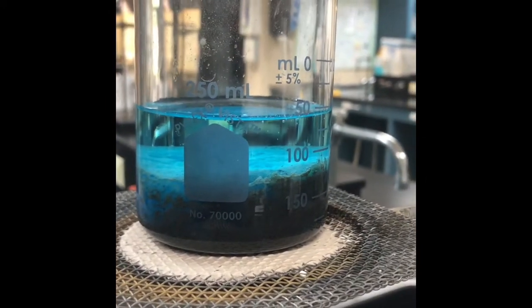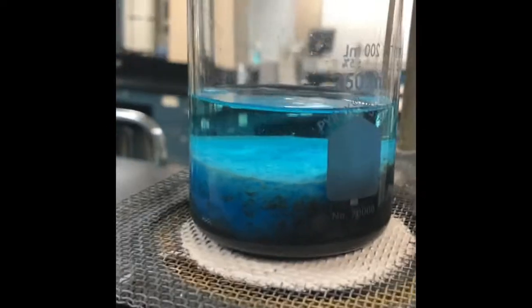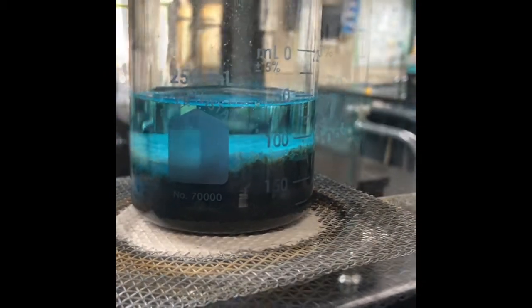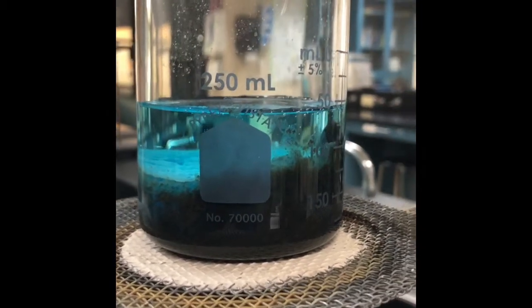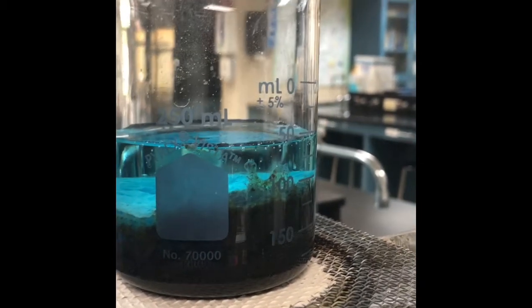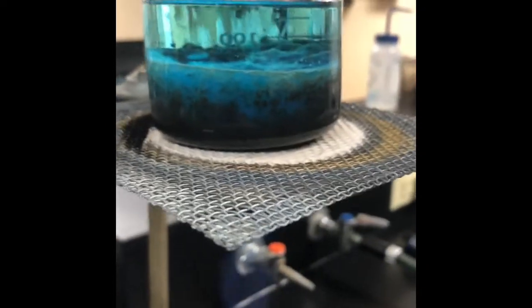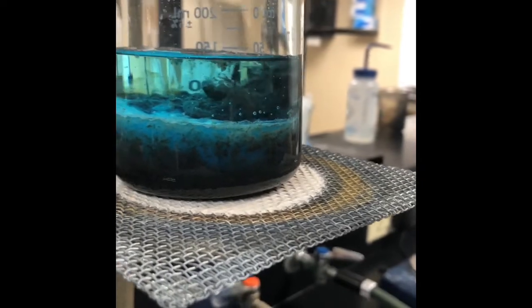As we keep heating this up, more and more copper 2 oxide is going to be formed. I like to call this New Orleans water after Katrina, because that's what it's going to start looking like. So the boiling chips keep this from boiling too hard, and it keeps it from splattering everywhere. So it provides even boiling. As more and more of the copper 2 oxide is formed, it's going to start looking more and more brackish.